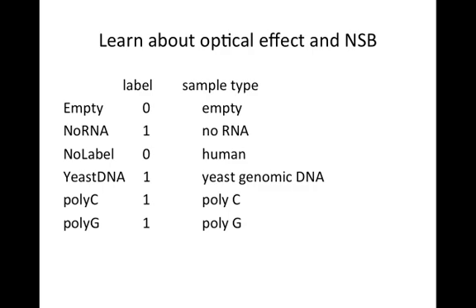human gene expression array. Because we know the yeast genome, we can actually remove any probe that has homology. And we also did just a poly-C and poly-G hybridized to an array. So at the end of the day, the one that was most useful was the yeast DNA chip. But anyway, I'm going to show you all the data that we obtained from this.